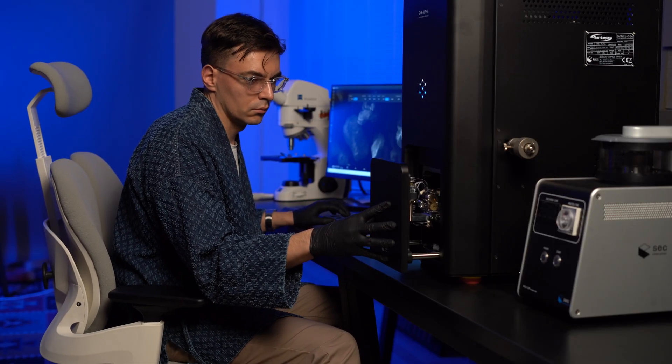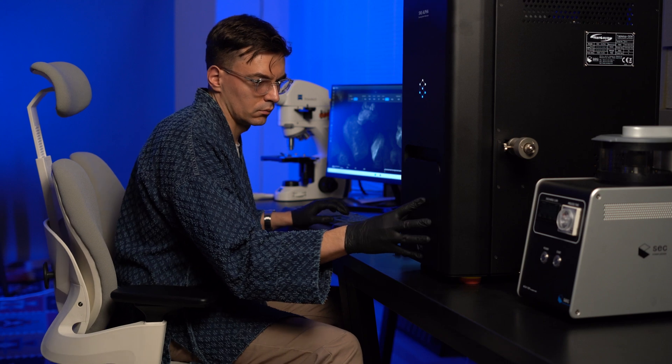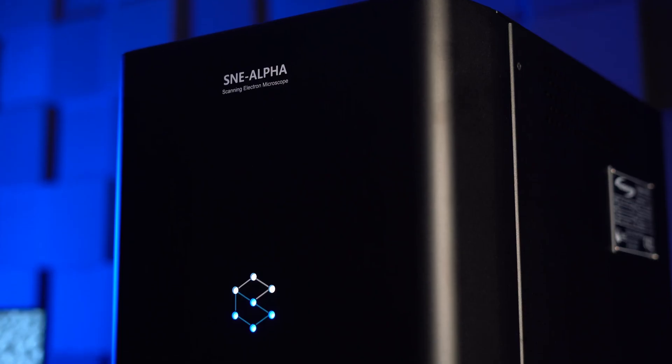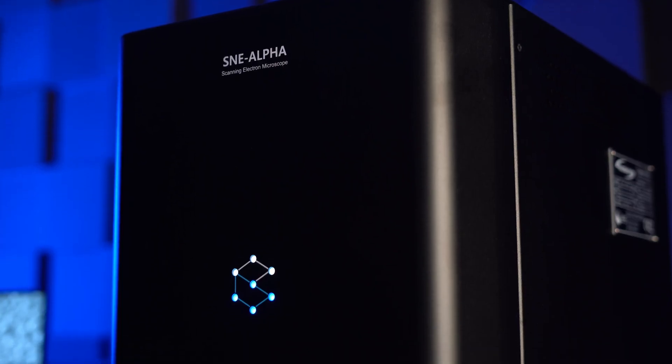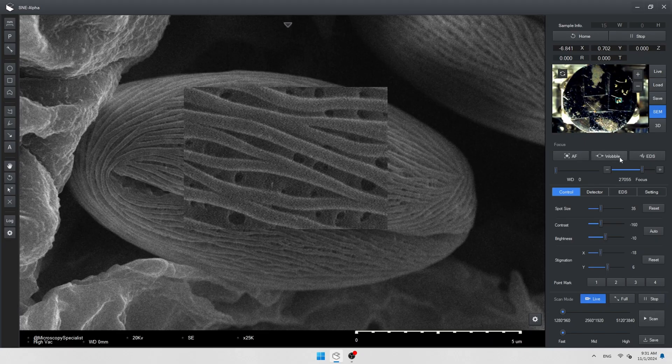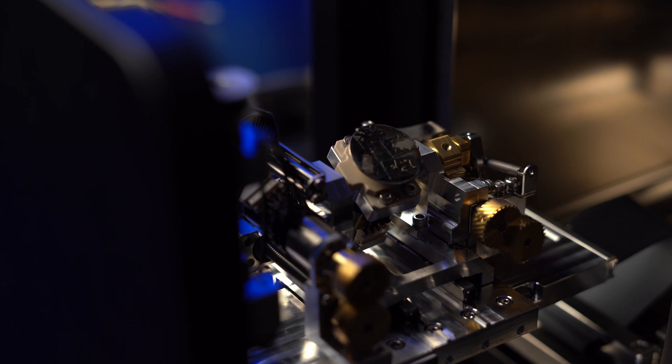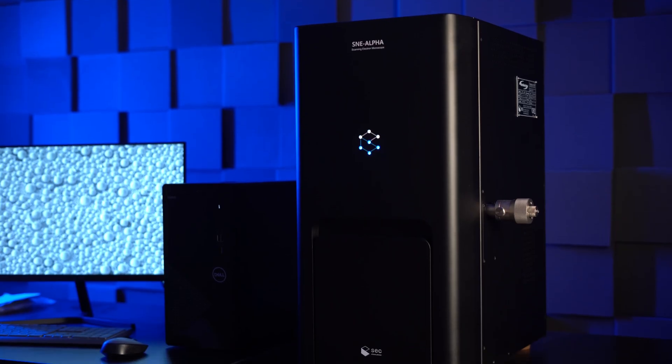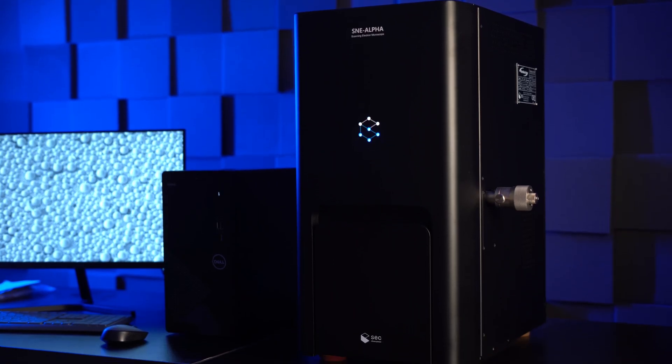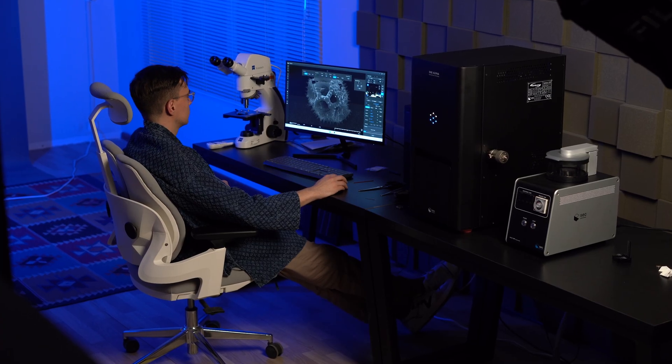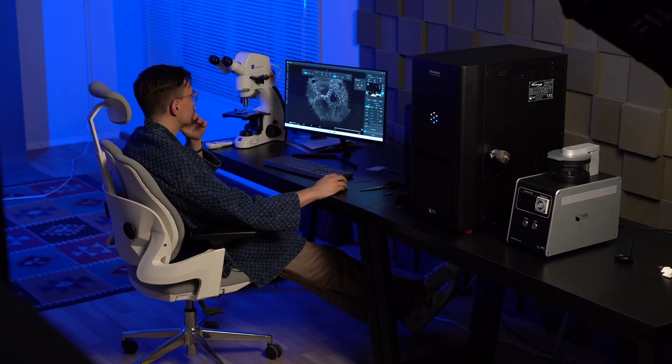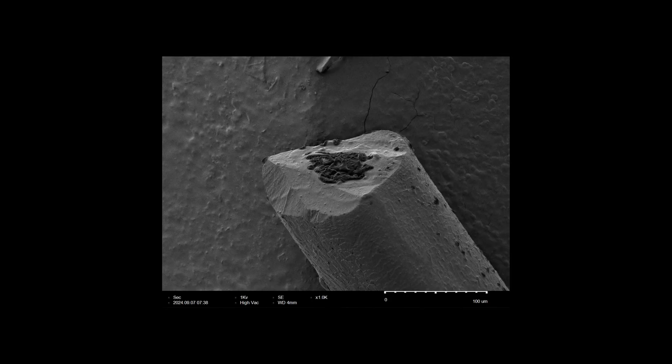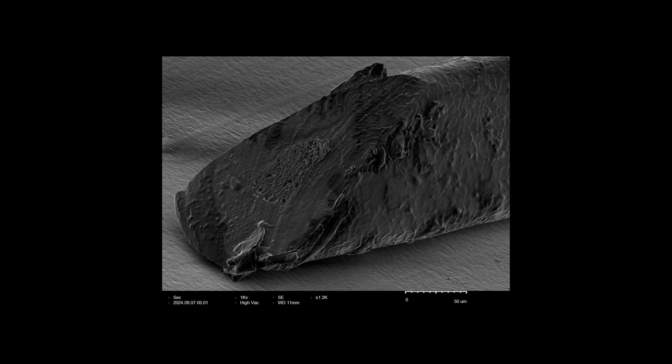So, my scanning electron microscope. Brand new SEC SNE-Alpha. Today I'll show you how it works, what is inside and why tabletop electron microscopes are super useful in almost every lab. Of course we'll capture some images of different objects, so stay tuned.